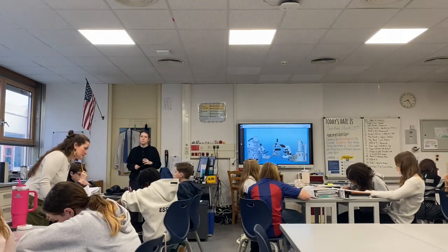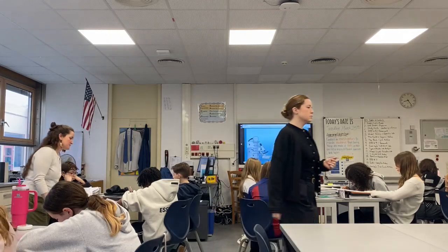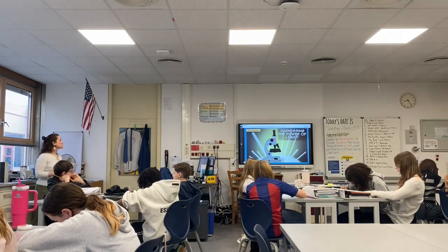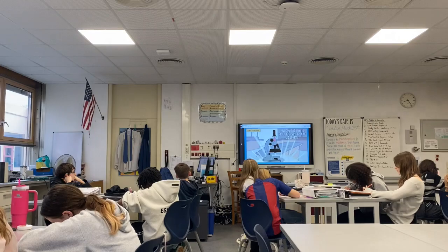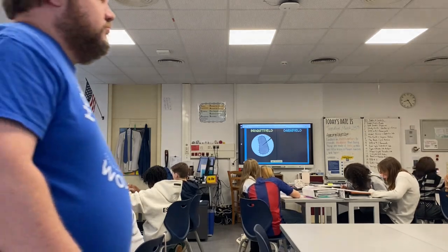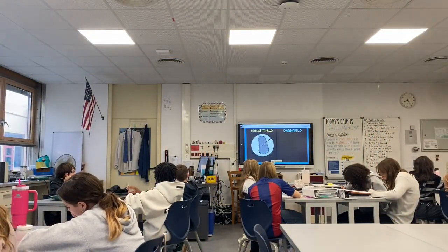So let's talk about some different types of microscopes that all take into account this need for magnification and resolution in order to see specimens. First, light microscopes. If you're in a classroom, this is likely what you have. And as its name would suggest, it uses light in order to see an image. Bright field light microscopes tend to be what people are most familiar with, typically producing a darker image on a light background.